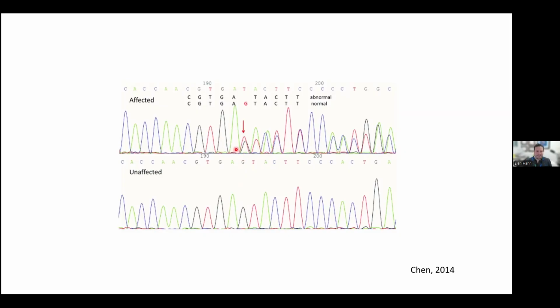So as you can see, you have an overlap of the reference sequence with the reference sequence starting one base pair later. So you have a G overlapped with this next exact sequence, and that's what a deletion of one base pair looks like in Sanger sequencing. If it would be more than one base pair, again, you'd have just superimposed the downstream sequence on where the deletion starts.